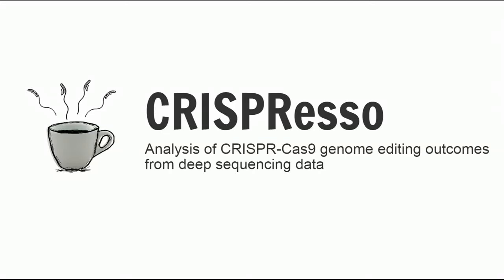Hello and welcome to CRISPResso. CRISPResso is a computational tool that allows for the quick and easy analysis of CRISPR genome editing experiments from deep sequencing data. This video will guide you through using the CRISPResso web tool to analyze your data.